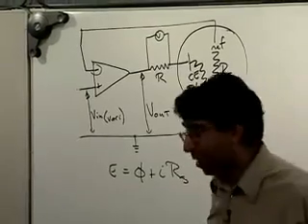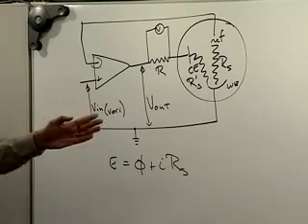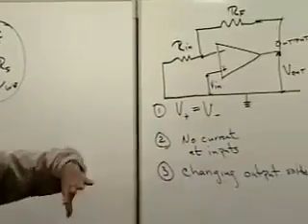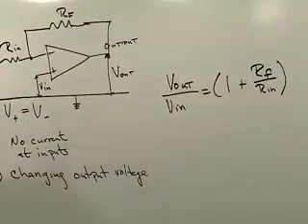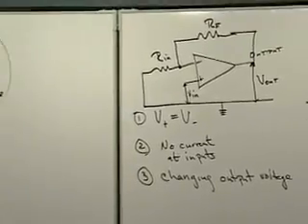Okay, so that's the potentiostat. What about the reference electrode? We understand the working electrode. The counter electrode we don't have to be too concerned about now. It's just off doing its own thing. But what about that reference electrode? What are we going to use over there?